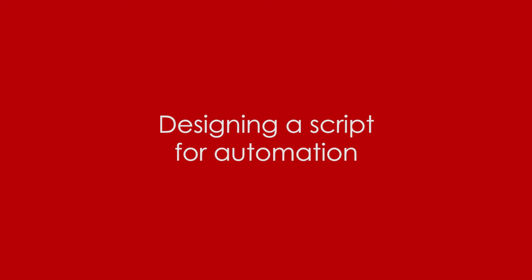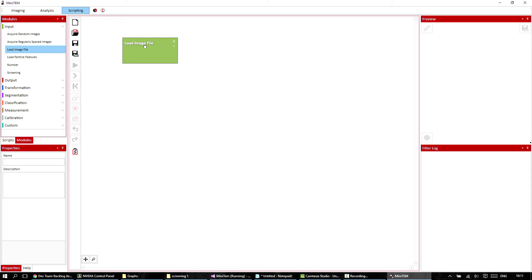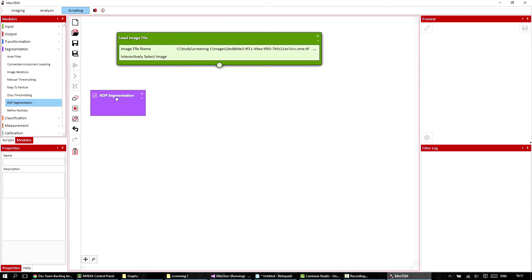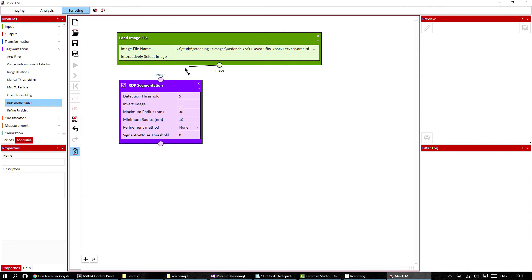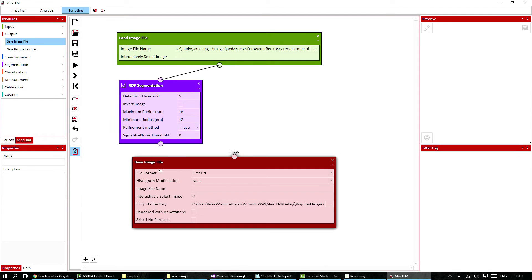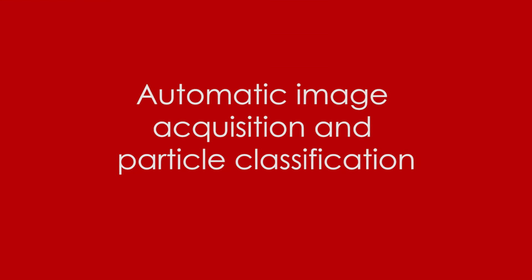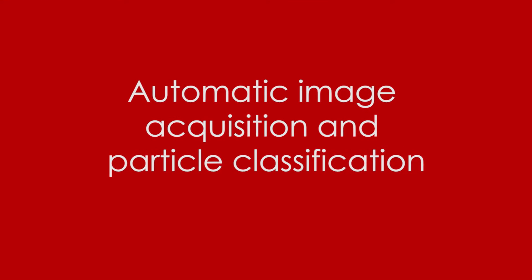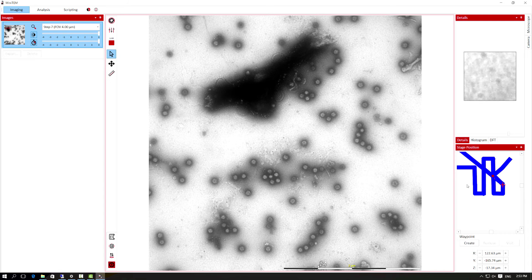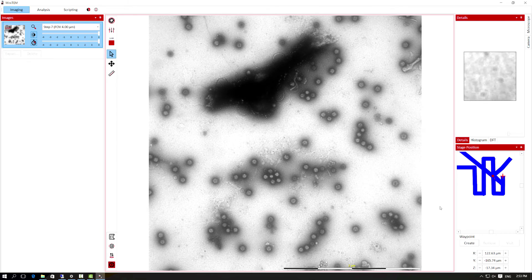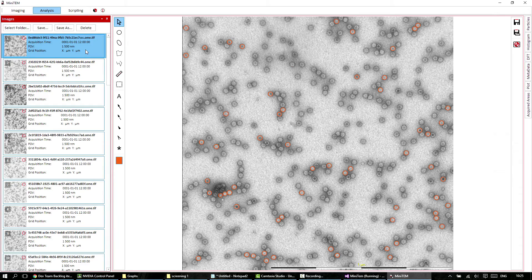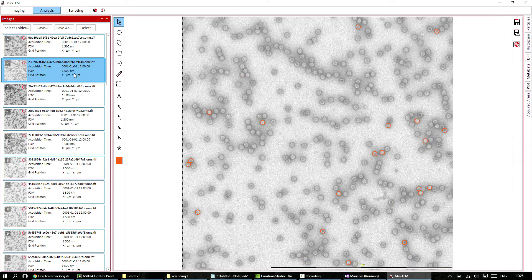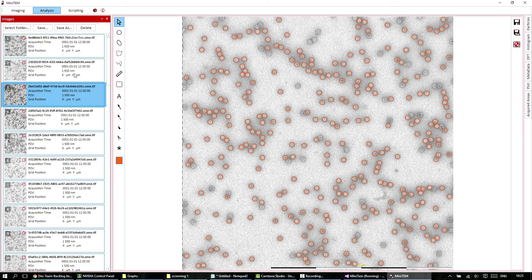To run sample characterization that includes both morphology and quantitative data, you simply design an automation script using drag-and-drop building blocks in Minitem software. Auto-focusing automates image acquisition according to preset waypoints, while particle classification according to pre-qualified parameters enables rapid quantitative analysis.